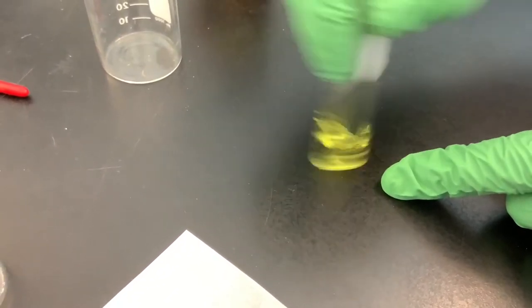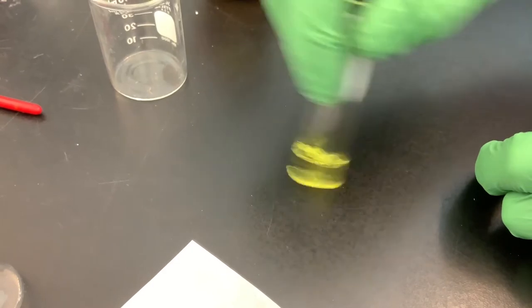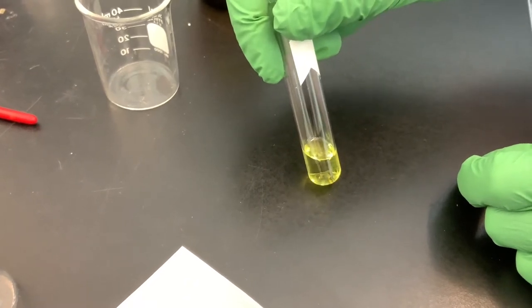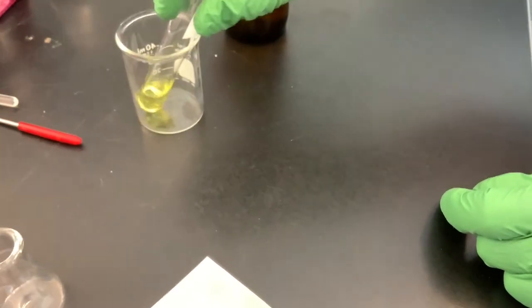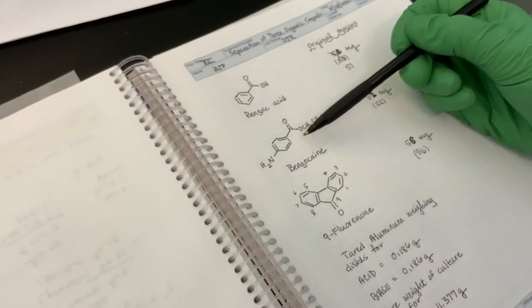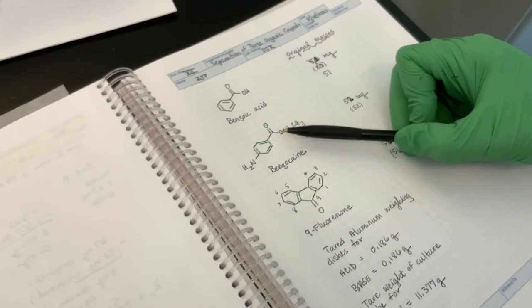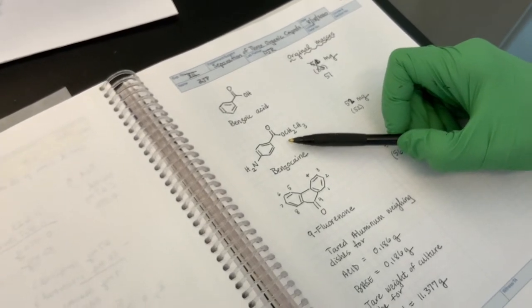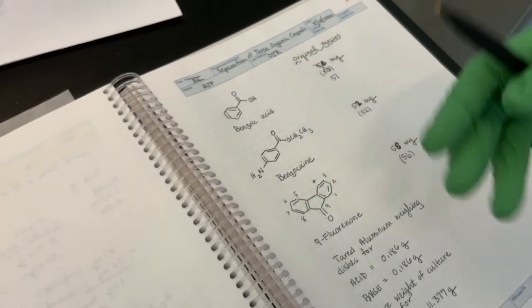So before we continue, we're going to just let this set aside and discuss the theory of the first extraction, because in our first extraction, our aqueous layer is going to have a low pH, so it's going to be acidic. And so we're going to use acid to isolate our base. So let's take a look at the structures here. So once again, this is our base, and so we're going to use acid to isolate benzocaine. And we're going to use acid because we're going to protonate benzocaine, and its conjugate acid is a salt, and therefore will be much more water soluble. And then we will extract the aqueous layer, therefore removing benzocaine from the organic layer.